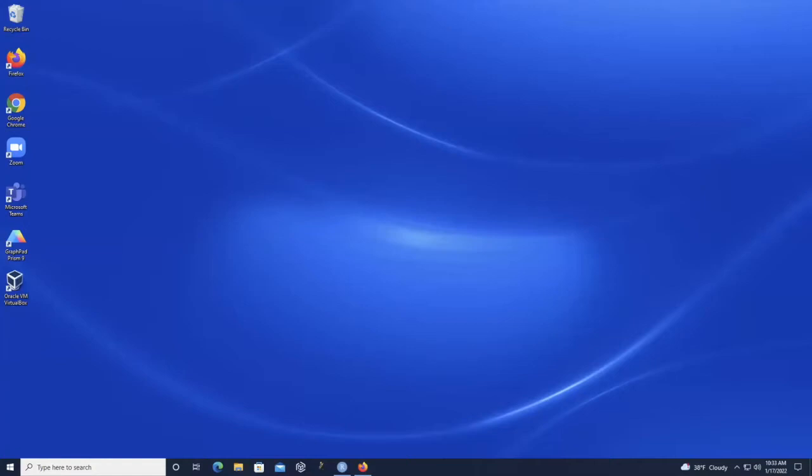This video is recommended for those of you having serious installation troubles with Wholebrain directly onto your computer using the original installation instructions. This is also recommended if you want to easily try some of the functions in Wholebrain or SMART before going through the full installation process.